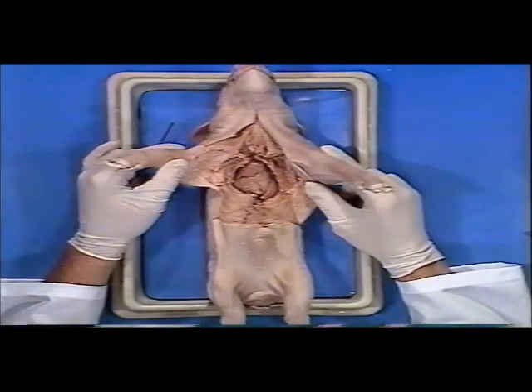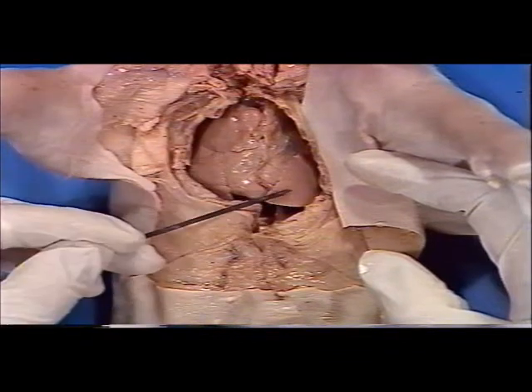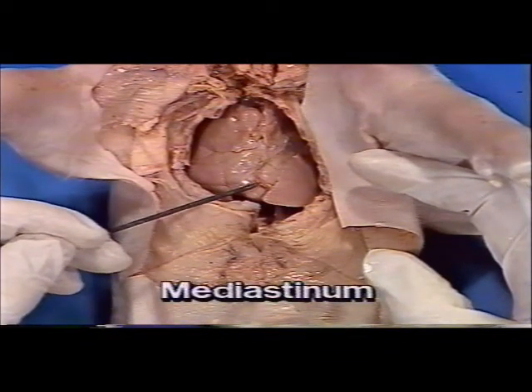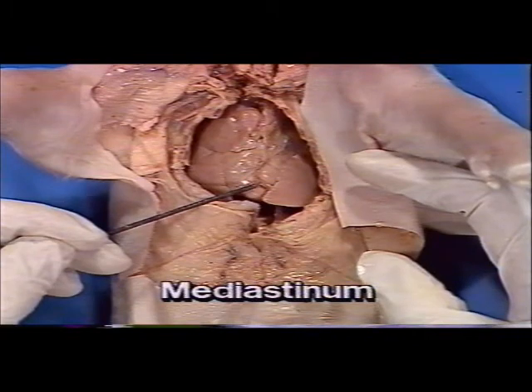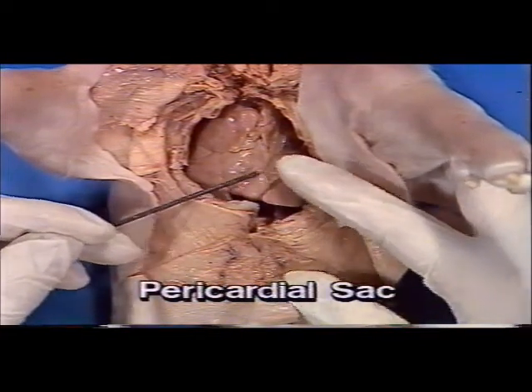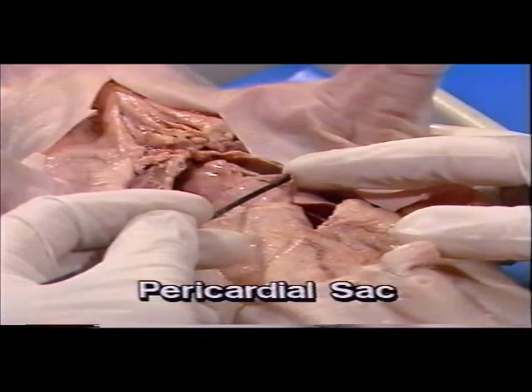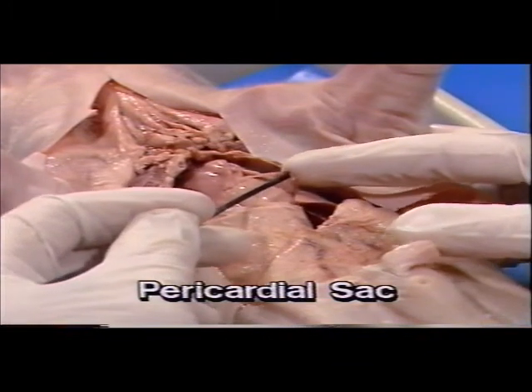Today, we will dissect the heart and attempt to explain its function through a thorough knowledge of its form. By observing the relations of the heart in the thoracic cavity of the fetal pig, you can see that it is located between the lungs in an area called the mediastinum, literally the place in the middle. It is surrounded by a sac called the pericardial sac. The word pericardium comes from the Latin word meaning around the heart.